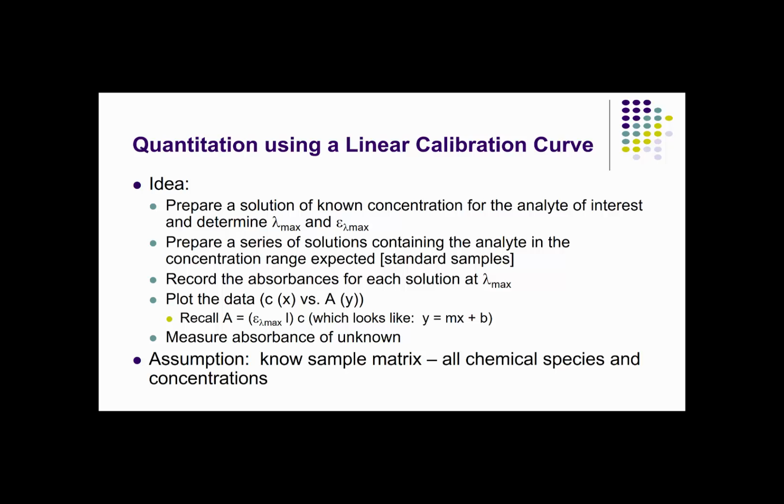Next, you're going to need to have some idea of what the concentration is for your analyte in your sample. And with this, then what you want to do is you want to set out to prepare a series of standard solutions containing your analyte that are in the approximate concentration range as you anticipate seeing in your unknowns.